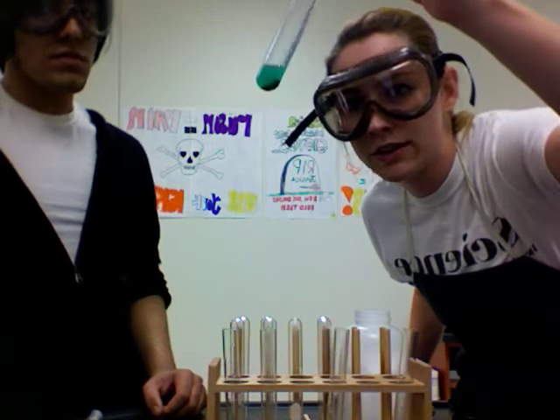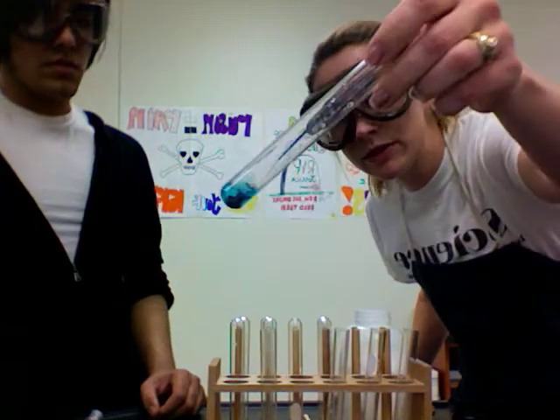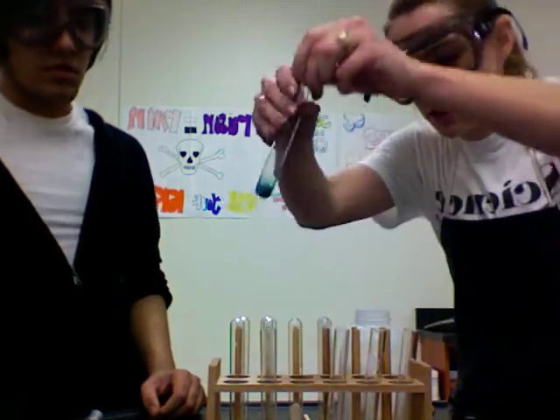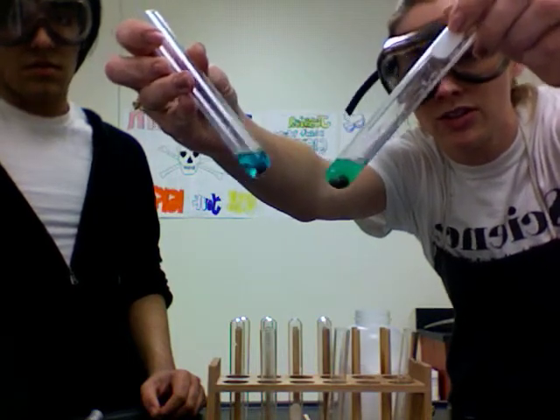We might revisit this one in a later experiment to see the color having gone away entirely. Here's our original one, so you can kind of tell the difference between the two colors — the color on this one is starting to go away.